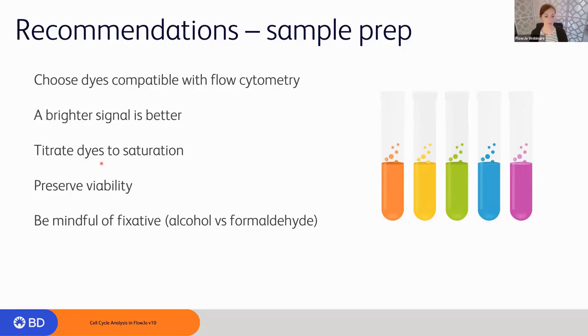Okay, so don't overdo it, but we also need to make sure that every cell has an opportunity to engage that dye. And of course, in terms of not overdoing it, we don't want to put so much dye that we introduce a level of toxicity to the cells. So we do still need to be gentle with the process and assess if we're killing our cells in the process of having them take up the DNA dye.